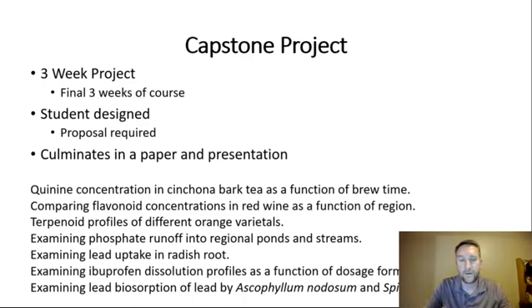this course this year, so I don't have all of their projects listed, but you can see the wide variety of things that they chose to do. I certainly did not dissuade them from taking examples from the experiments that we did during the term and then modifying those to look at a different chemical question or even a related chemical question. So we've got some really great ones that they're going to be starting on Tuesday of this week, including looking at quinine concentration in cinchona bark tea.